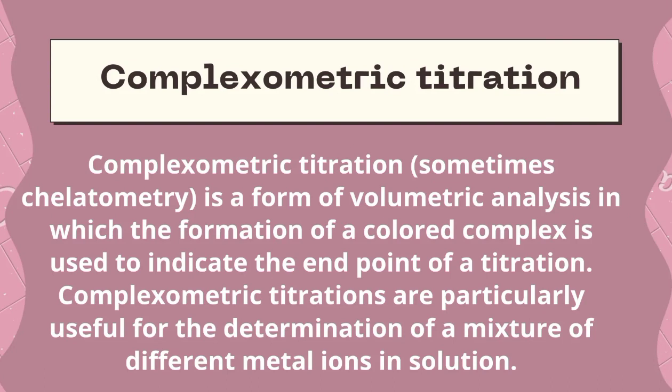Lastly is the complexometric titration. Complexometric titration is a form of volumetric analysis in which the formation of a colored complex is used to indicate the end point of the titration. Complexometric titrations are particularly useful for the determination of a mixture of different metal ions in solution.